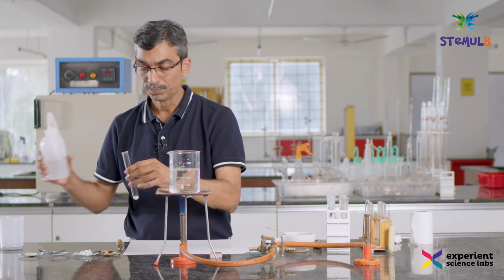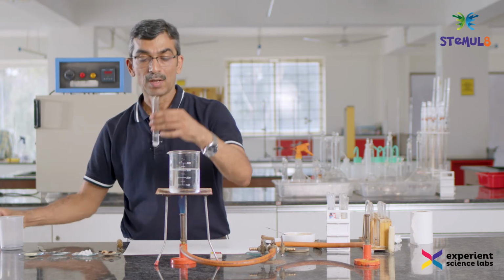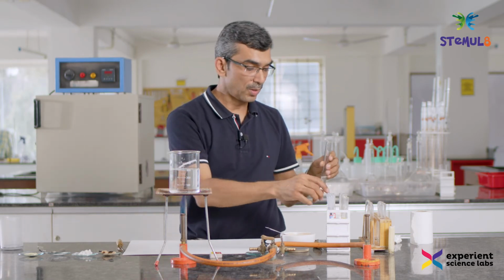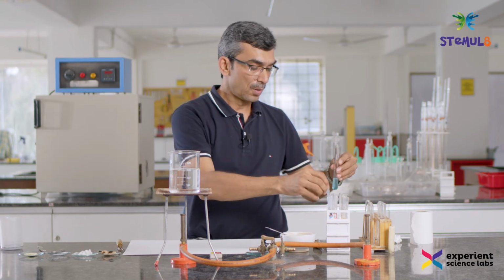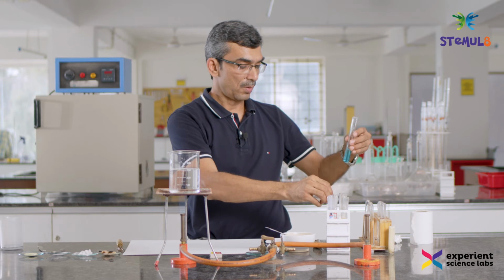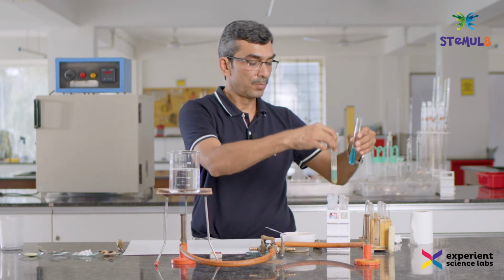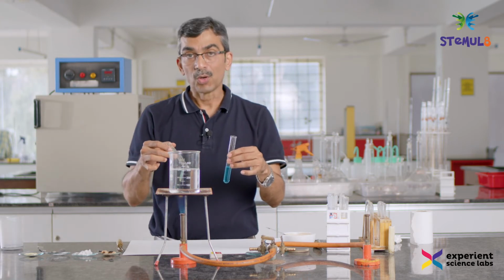That's good enough. It must be 4-5 ml of water. Almost all of the sugar is dissolved, and the rest will dissolve when it gets heated up. Again, I will add 4-5 ml of, I think I've added at least 3 ml by now. I think that should be enough, and this has also settled down. So these are the two food items that we are going to test.